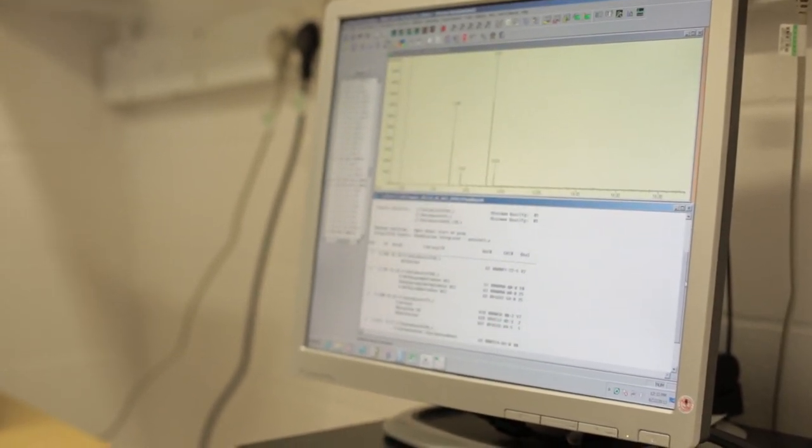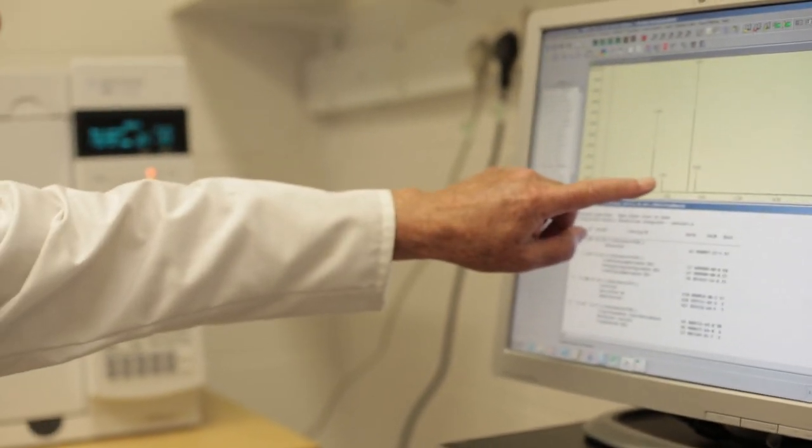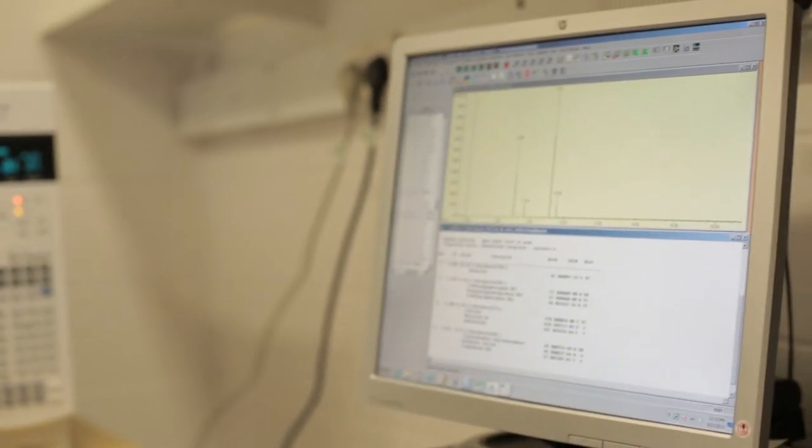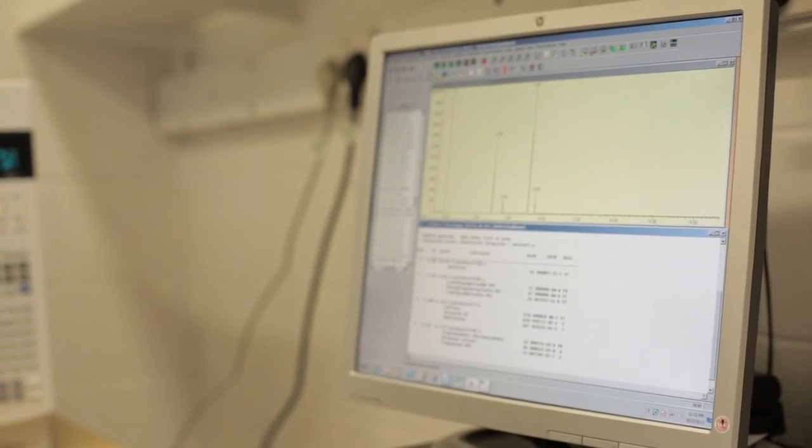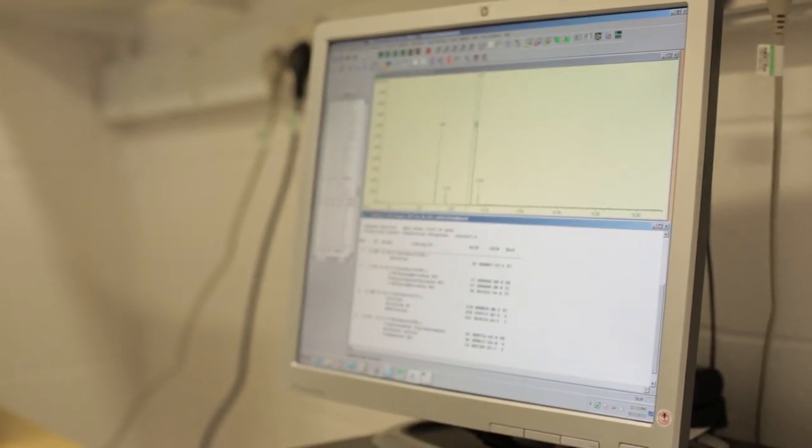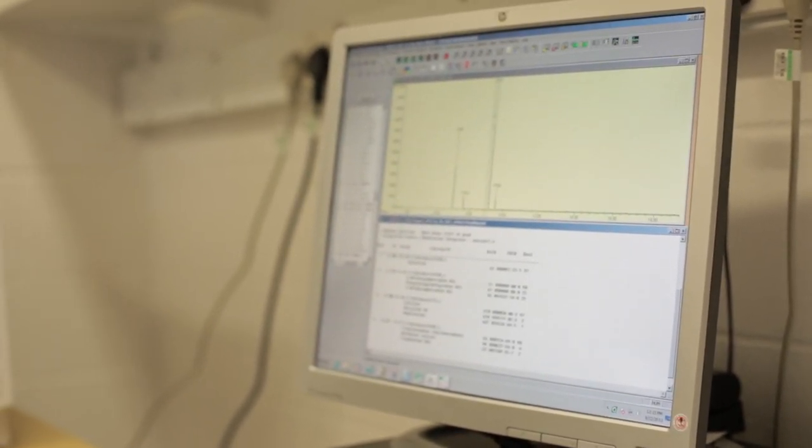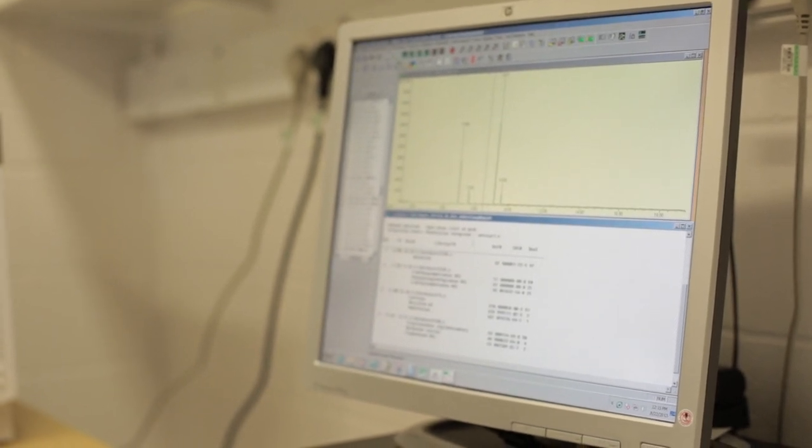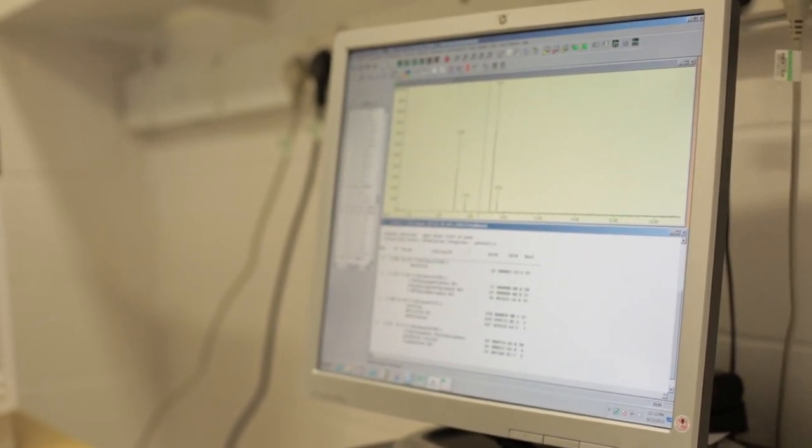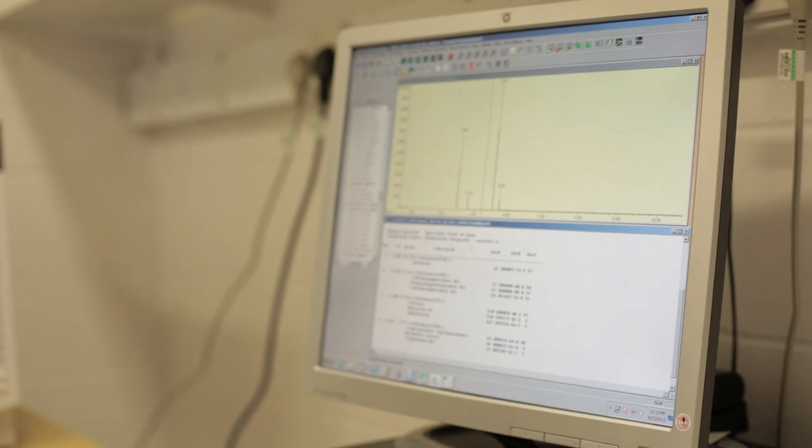And when we do that, it shows us that the first peak, this one here, is 4-methoxyamphetamine, PMA. And the second peak at 9.111 is caffeine. So we've shown that this green tablet contains a mixture of PMA and caffeine.